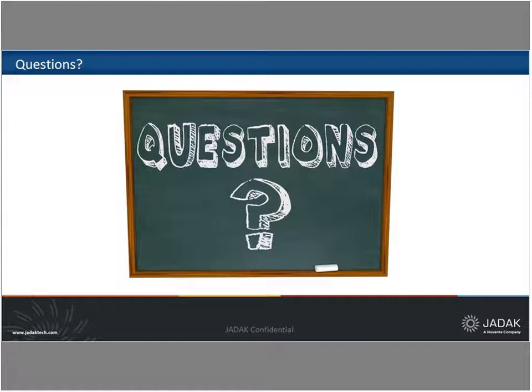Yeah, I think I took care of that one. But yes, there are specific country regulations. Oh, and the other thing to consider, especially in Europe, is that they recently passed and required the RED directive, which is the Radio Equipment Directive. Any devices sold to Europe need to be RED certified. And once again, I would say 90% of the devices that we have at JADAK have passed RED certification and are capable of being sold in Europe, but that's something to consider again.